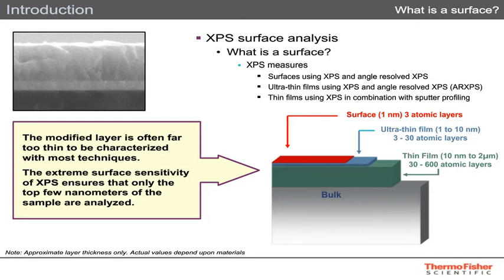The sampling depth of Raman spectroscopy depends strongly on the material being analyzed and the wavelength of a laser used to probe the surface. In some cases, it is more appropriate to think of Raman as a bulk analysis technique. But in the case of 2D materials, because the materials themselves are so thin and they have a high cross-section for Raman analysis, the spectroscopy can also be thought of as a surface-sensitive technique.